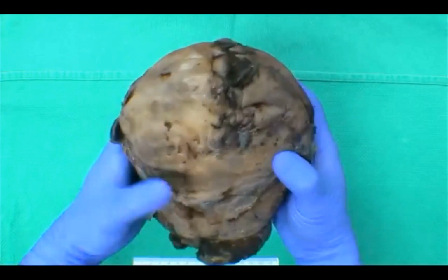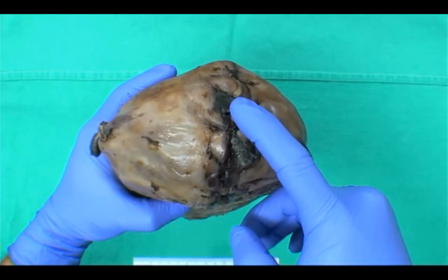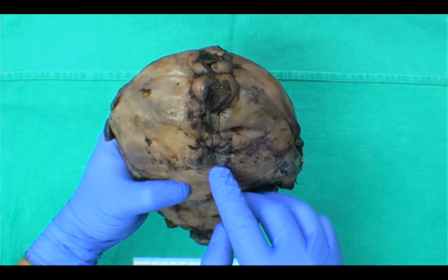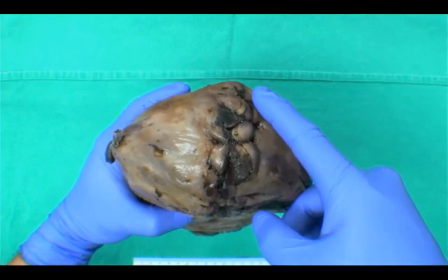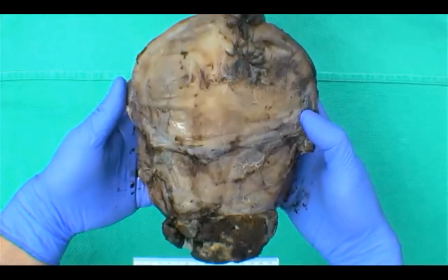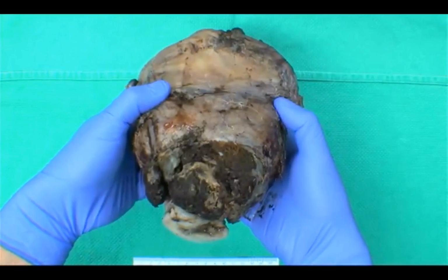And some of the additional landmarks you can see, if I turn the uterus up towards the fundal aspect, you can see this linear disrupted area. This is where the cesarean section actually occurred. Women who come in with these complications require a big multidisciplinary team for support and care during delivery. The baby is extracted through this cesarean section site. Once the baby is safely delivered, the surgical care team would then carefully perform a postpartum hysterectomy, where they attempt to take out the entire uterus and the placenta in one piece.